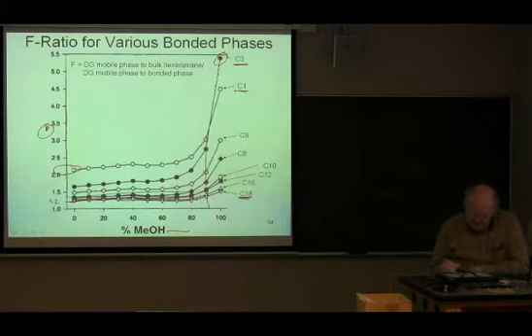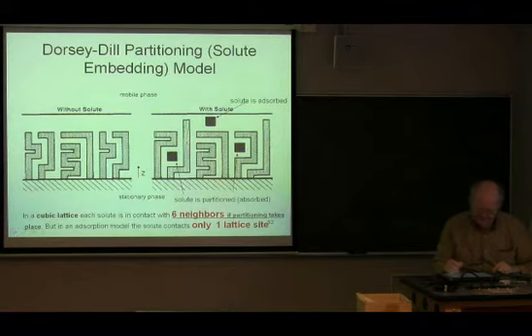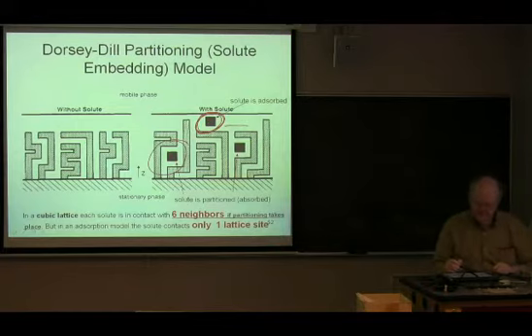Clearly, for the long chain silanes, this is much closer to a partitioning process than an adsorption process, which means that the CH2 groups, the non-polar parts of the molecule, are really down here. And there are not much of them out here at the interface between the two phases. This would be the adsorption, this would be the partition or embedded situation.